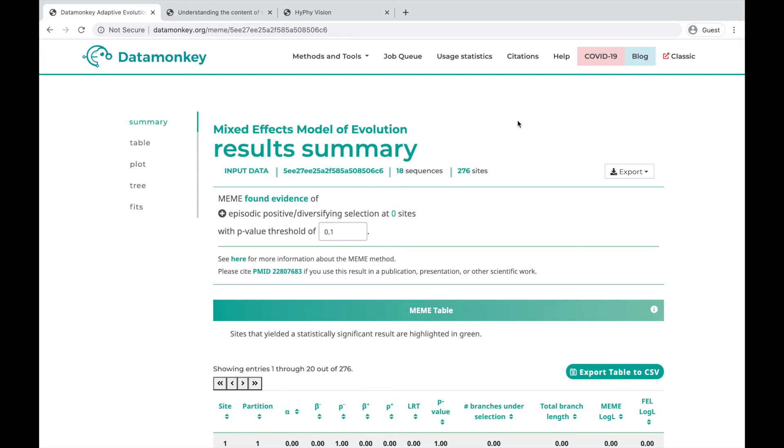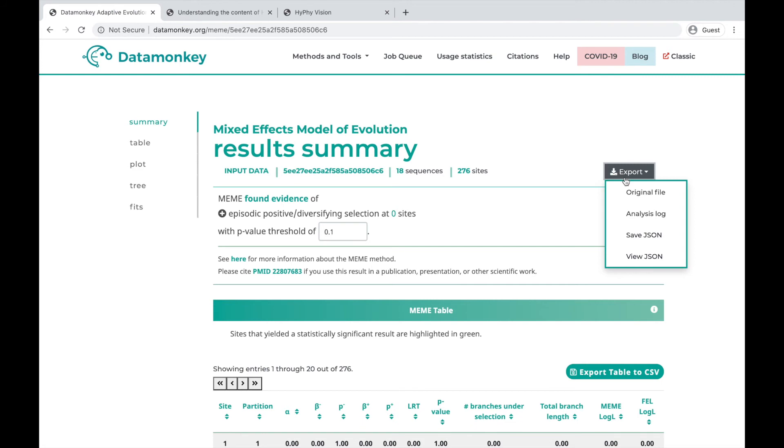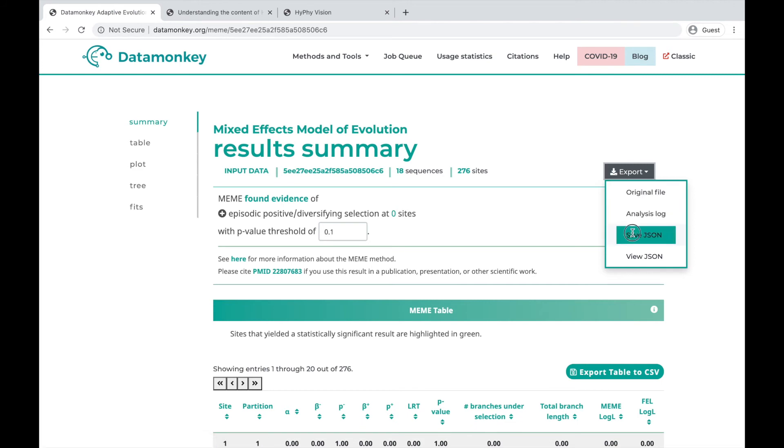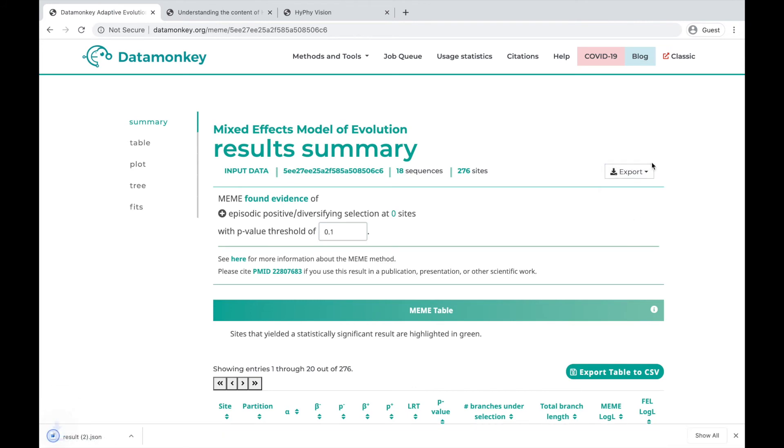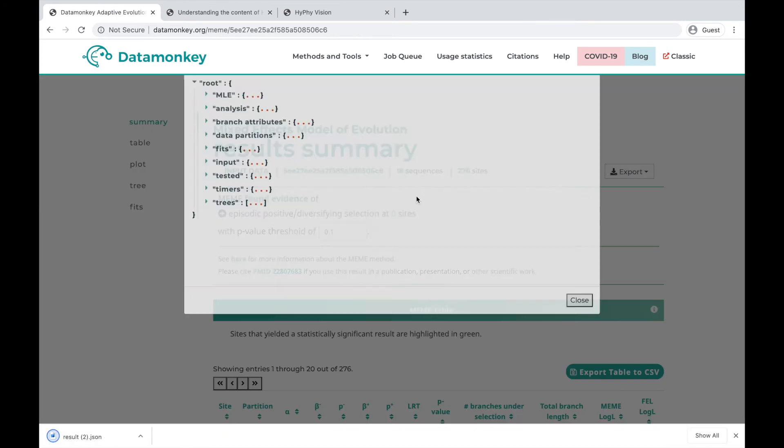For any Datamonkey analysis, you can click this export button where you can download the original file you ran the analysis on, the log, you can save the JSON, or you can view it in the browser.